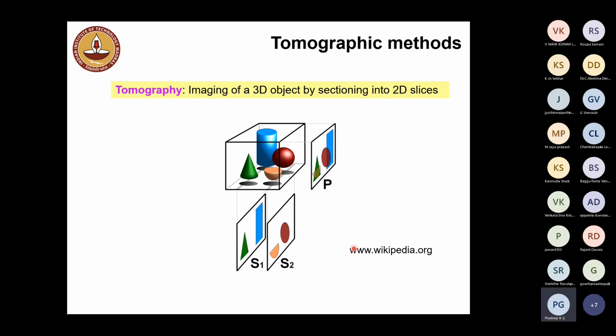So tomography is basically indicating that anything that we can image in a 3-dimensional way, either by serial sectioning in 2D form, or we can use it in a bulk way, as you saw in the atom probe tomography, is something that represents a 3-dimensional space is called tomography. That means you can now have a cube or a cuboid, as you see here in 3 dimensions.